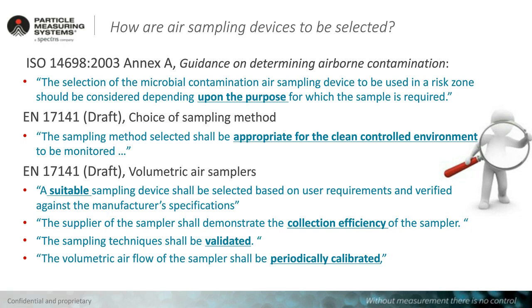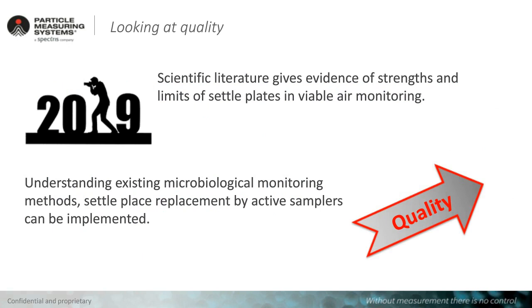As a conclusion of the first part, we need to understand that the scientific literature and the norms and the standards that we have been looking at give evidence of strengths and limits of settle plates in viable air monitoring. We understand that there are clear limits of settle plates, and from our practical experience in pharma, we know as well that the problem of settle plates is that they are easily contaminated by the operator.